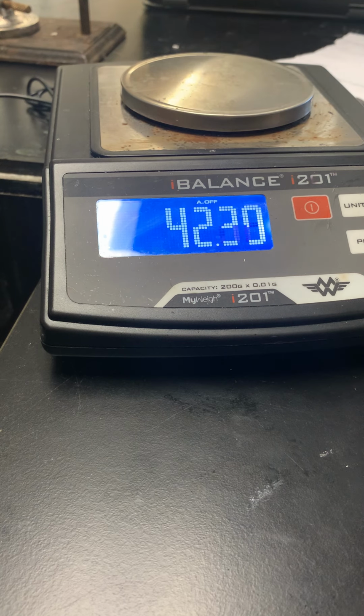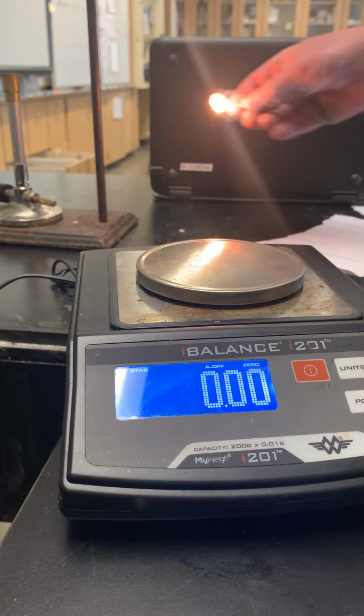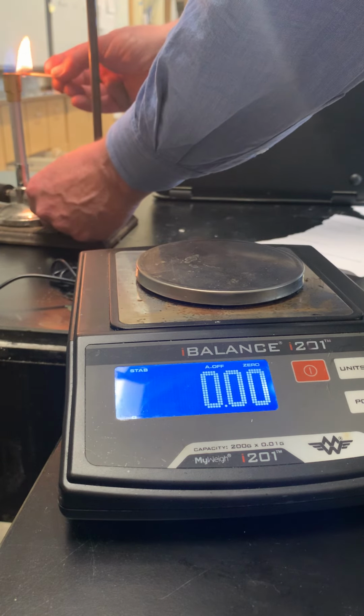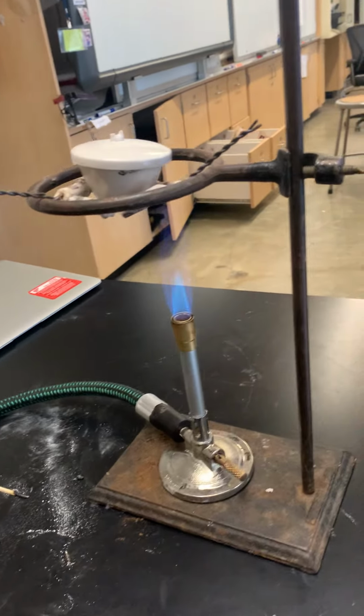And then that goes on here. And, oh, you can't see. Scoot that back. Still can't see. That's okay. I'm gonna light the flame. Yeah, which you could see. And we have our magnesium.